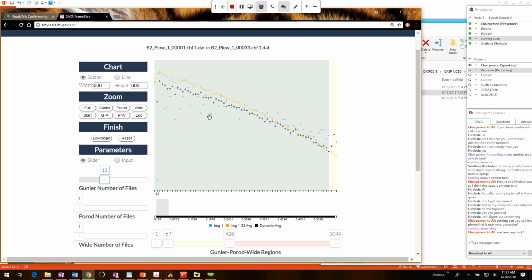So it looks like the teal curve is beyond the noise within the data. It looks like out in the wider part of this Guinier region, it's no longer within the noise. It's also deviating in the small Q region. So I'm going to backtrack that, and I'm going to go down to 4. Even there already, it's still not quite within, so I'm going to backtrack a little bit more. 3, maybe 3 frames already. Looks better. Maybe 2 to be safe.